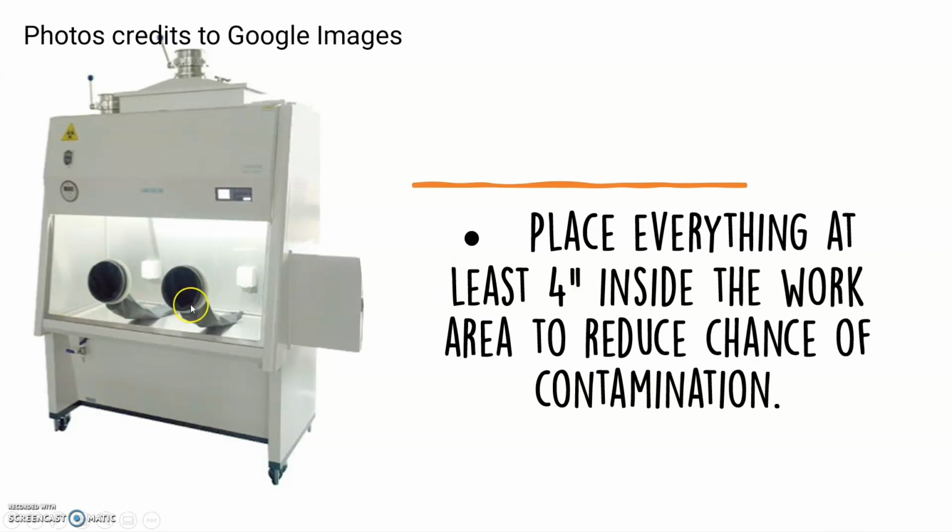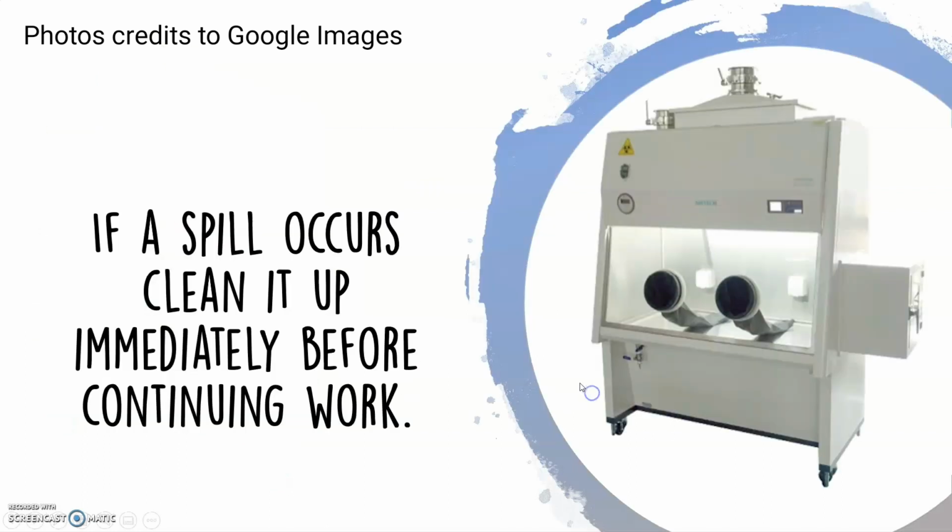So this is the biosafety cabinet. You are doing the experiments inside this cabinet, so the virus and the bacteria will be confined in this area.